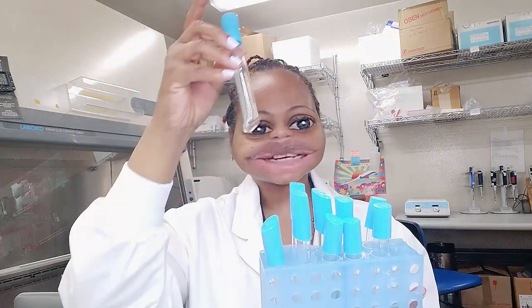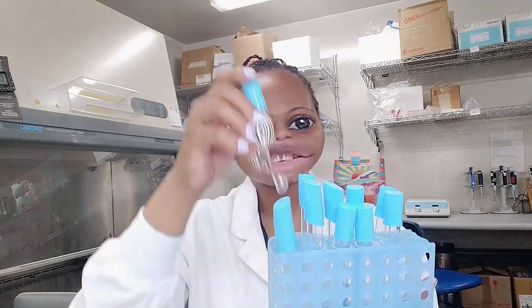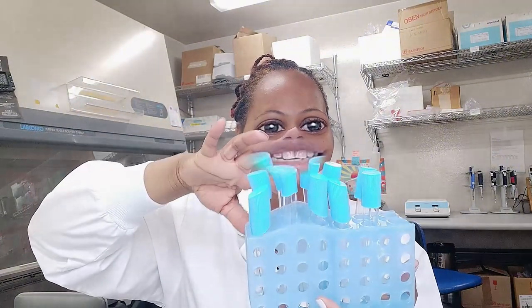You'll have your original sample. You take a particular amount, you put it in, it's one ml, you put it in nine ml of water. Then you shake, shake this up, pipette it up and down to mix. You take one ml from this, put it into the second one which also has nine ml. Then you take one ml, put it in the other one, it's a serial dilution. It's a one in ten dilution, one ml in nine ml.